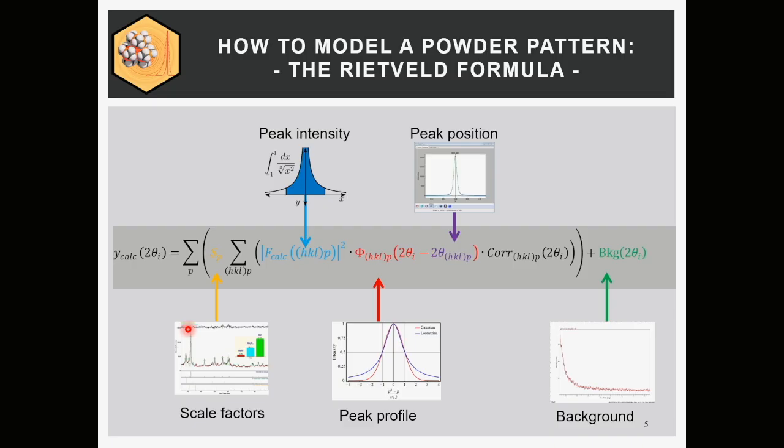And what we are calculating actually is one single intensity in your powder pattern. So if you have 10,000 points in a powder pattern, it starts from 0 to 9,999, okay? So at any position, you have to figure out, or the program has to figure out, how many phases actually contribute to this position. And that's actually an important question. So in theory, you can say, okay, all phases contribute to all points in the powder pattern, but then the calculation is just too much.